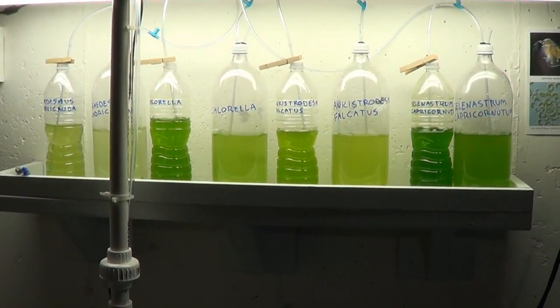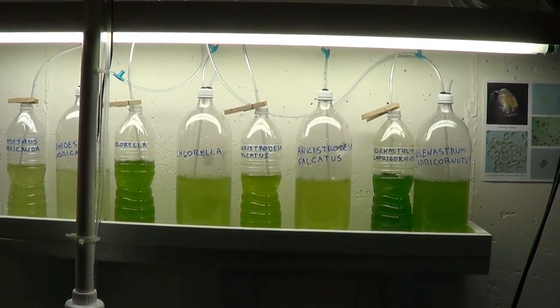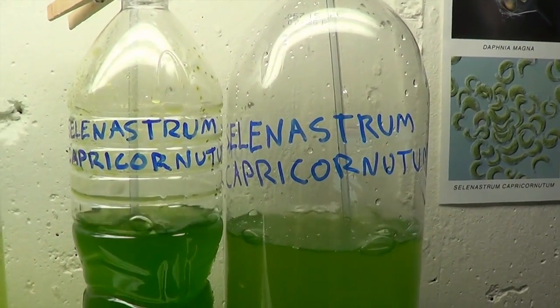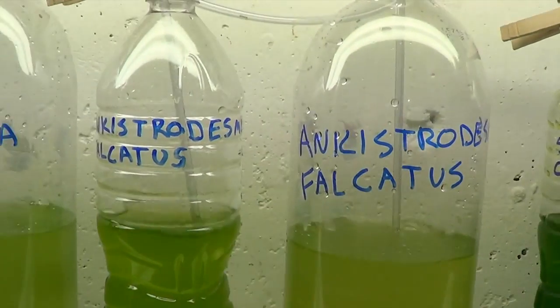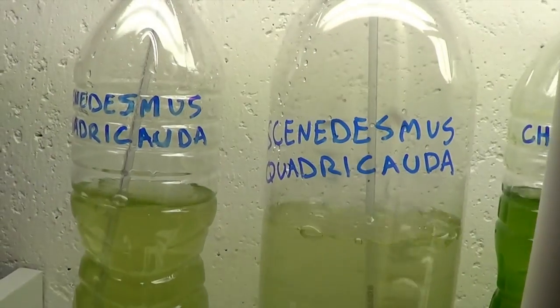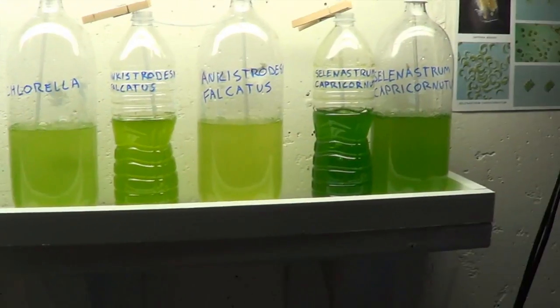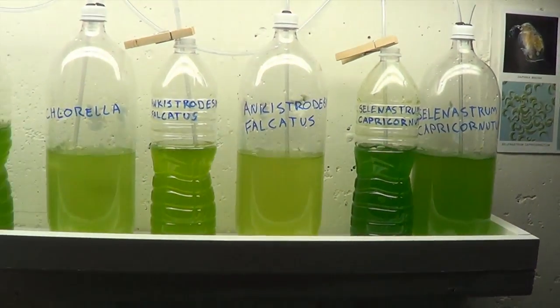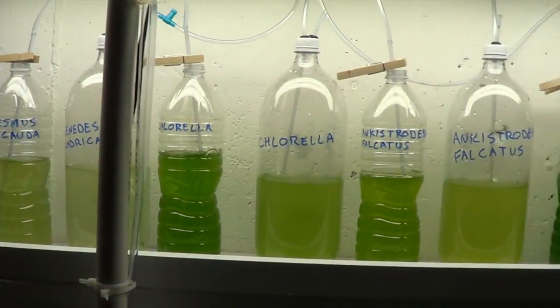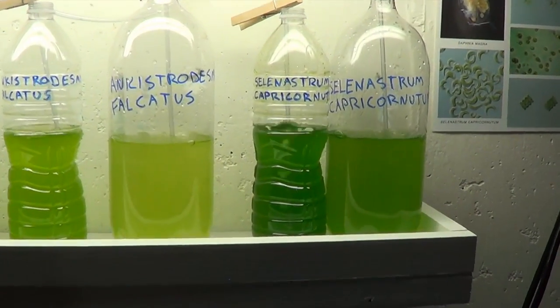Alright guys, and here's the finished product. We have our photobioreactor completely installed and up and running. As you'll see, we have two cultures now of each of the four species of freshwater algae. And the reason I got four species of algae is just because I wanted to test out which one was the most prolific, which one reproduced best under the conditions that I have here. And so I went ahead and picked up the four pack that Carolina Biological had.